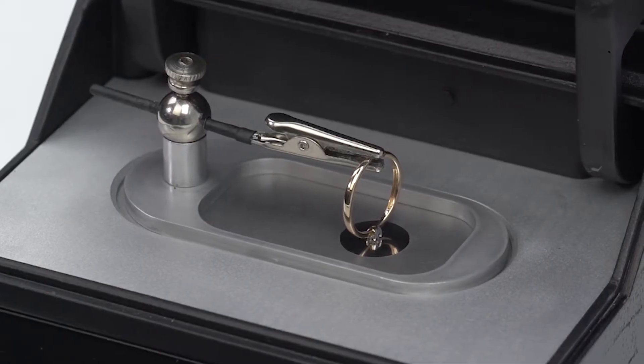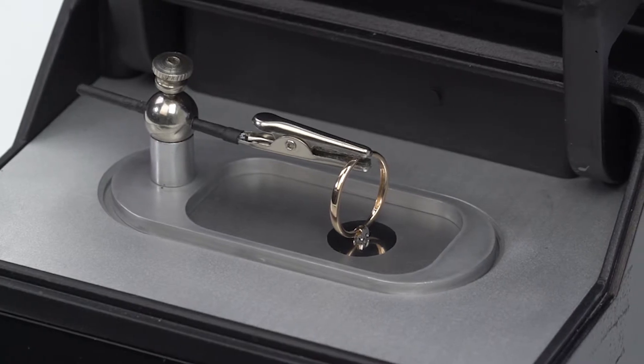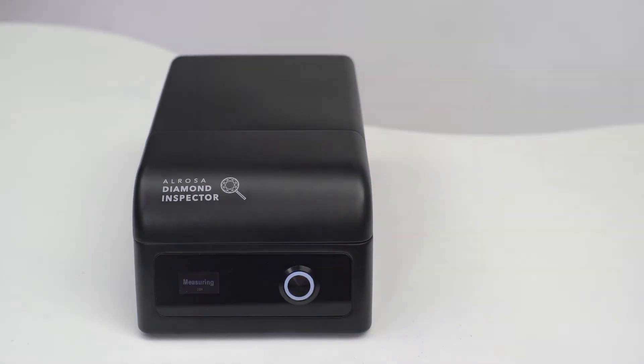It is important for the diamond table to tightly adjoin the target hole and not to be skewed. Closing the cover, make sure the holder doesn't interfere — otherwise the cover will not close fully or the holder will shift. The measurement result is 'natural.'